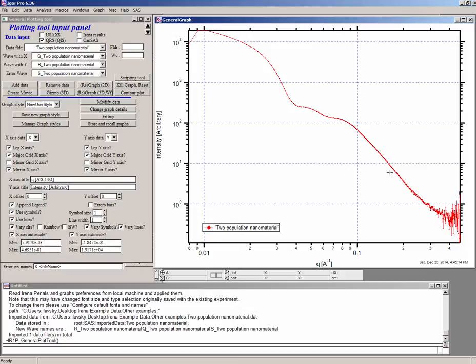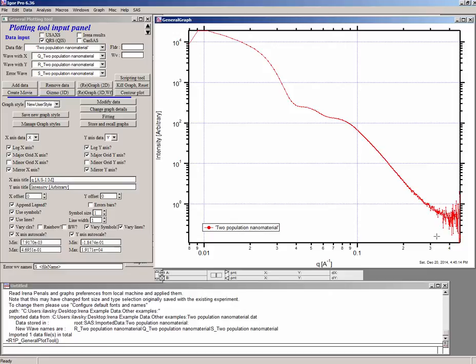The other thing to note is that as you go to higher and higher angles, there's lots and lots more points out there which have a really very low information content. There's really just noise in them. And so either we could truncate them, but then we lose some information which is still left in them. What I prefer to do is actually go and do a log step rebinning.